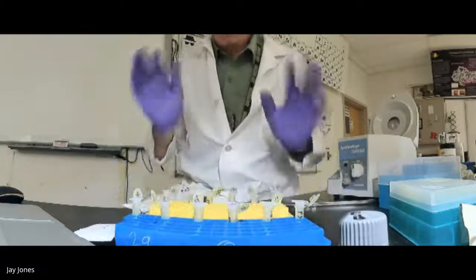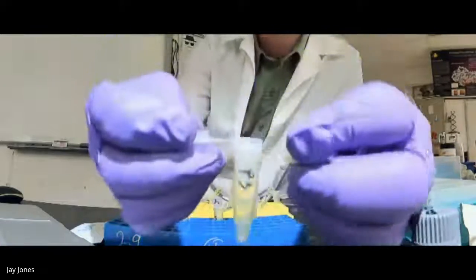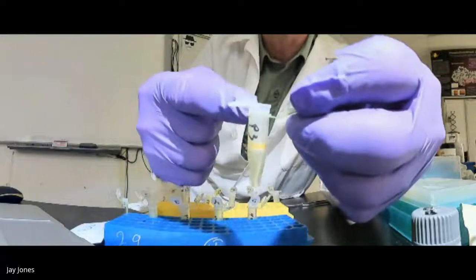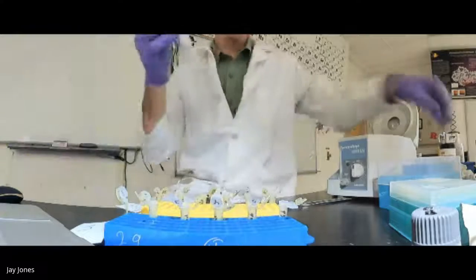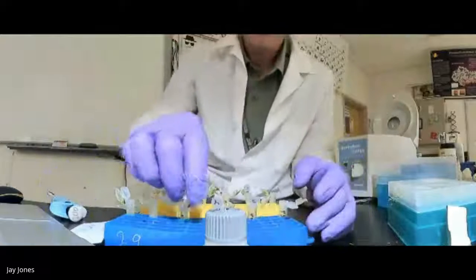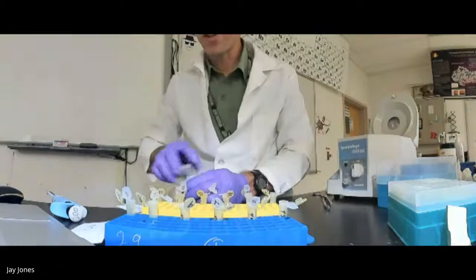All right, so now, we're going to do the elution step. I'm going to open up all of these spin columns that are nestled in the yellow tube, just to sort of show you what I'm working with here. I have the spin column now in the yellow tube. With the spin columns in the yellow tube, we're going to put in elution buffer and pull the DNA off the column so it can flow into the yellow tube, the final tube. Okay, here we go. Now we're going to do this with EB, elution buffer. Now, interestingly, elution buffer is just sterile water for the most part. It's just sterile water. DNA is super polar. Yes, charged. So polar, it's charged. And water and charge love each other, as you know.